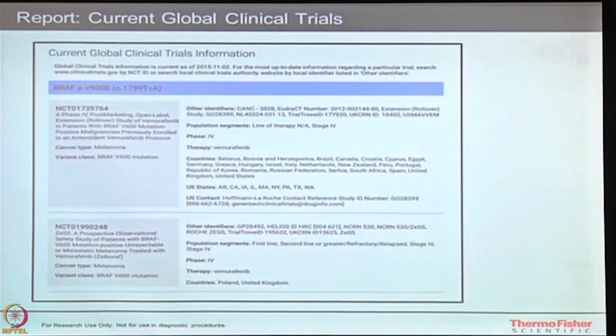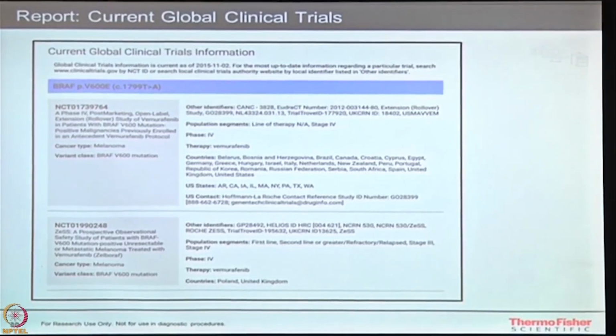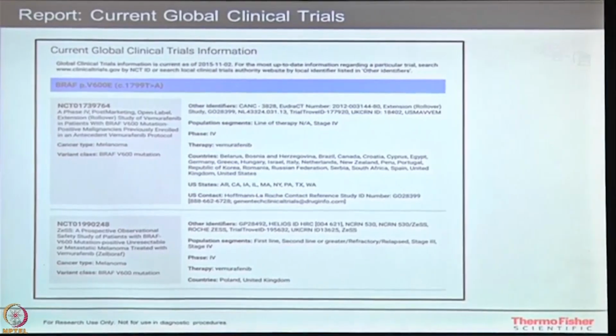Once this report is here, you can utilize the same report. It goes to the patient and you can directly assign drugs, or there could be a discussion between a clinician and the doctor who wants to give the drug and take it further.